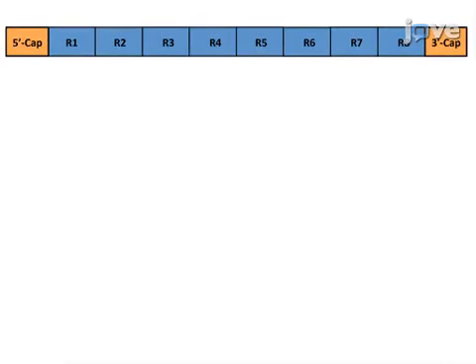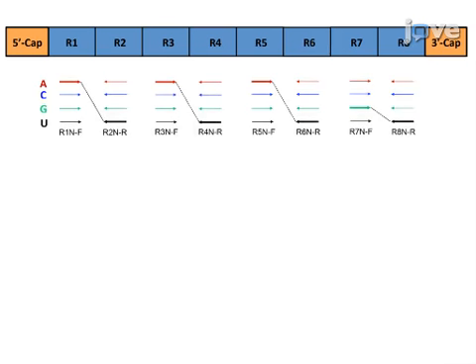Wild-type PUF DNA is used as a template for generating the customized PUF domain scaffold. Use PCR primers containing PUF sequences that specifically recognize different RNA nucleotides in each position. For each PUF repeat, use 4 different primers to recognize a different base on each position.